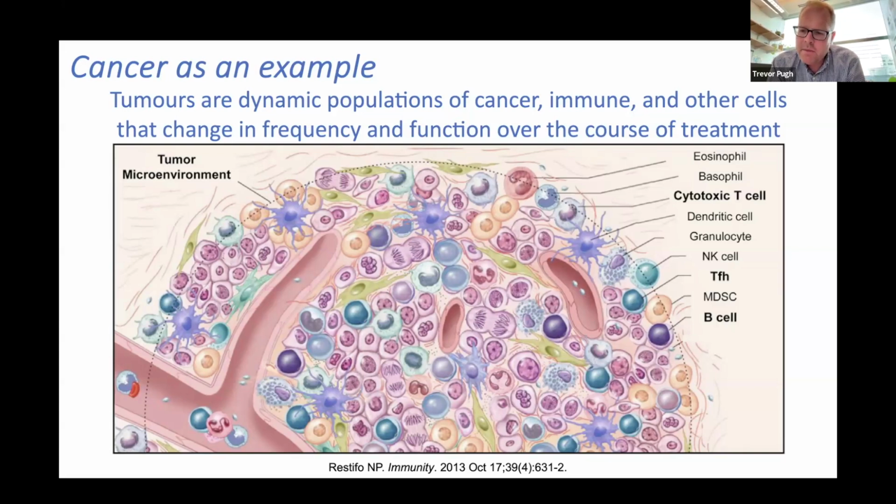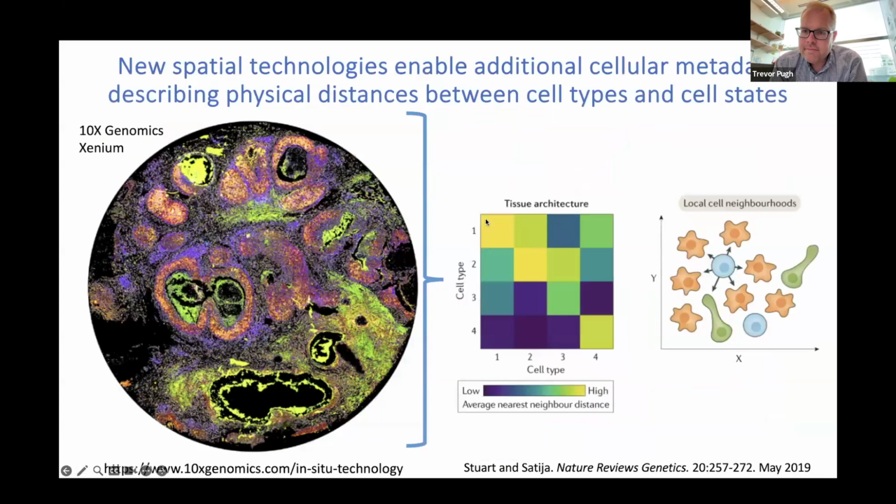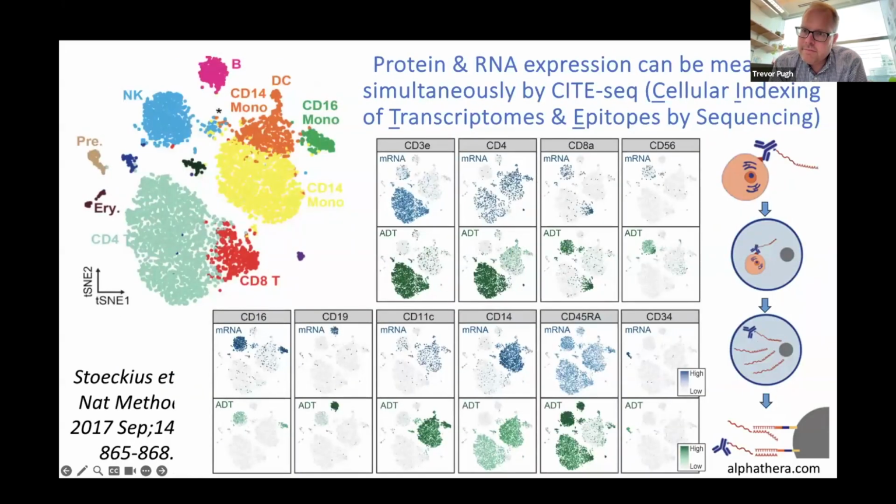Do you have more information on AB-seq that you could share? Hang on just a sec. It's just because one of the postdocs in my lab is using AB-seq, where I think it's a protein probe instead of a DNA, or the oligo is formatted differently. But from my understanding, it's pretty much just a way for her to enrich for T cells.